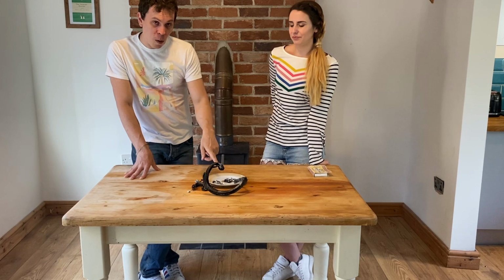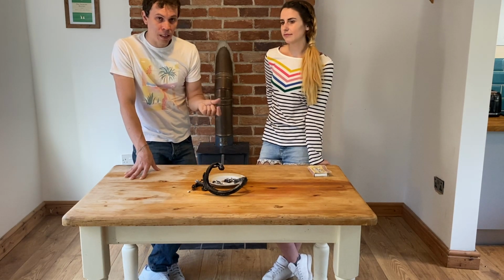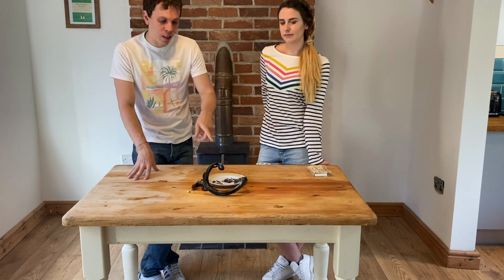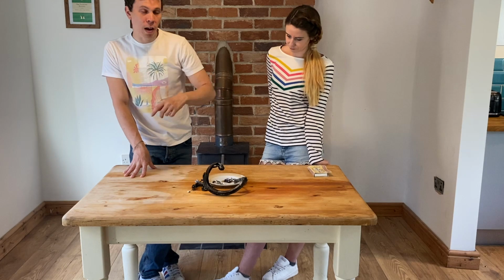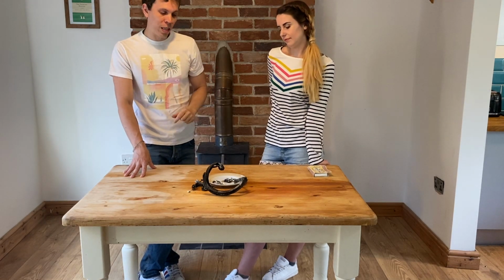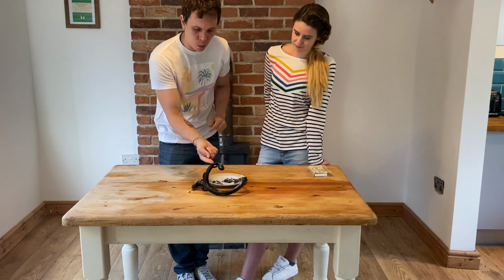The chemical on top, when it burns, forms an ash, because it also releases some gases as well, water vapour and carbon dioxide gas, that causes lots of little air pockets, makes the ash very porous and plumps it out. So you end up with this huge volume of ash that comes out from seemingly a much smaller mass to begin with. But it's just because it's all very, if we were to touch it, it's going to just drop apart basically.